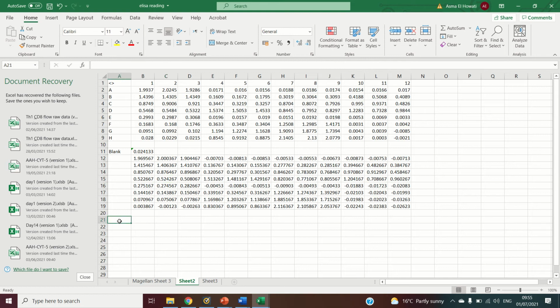So I will start with setting up the standard values, the concentrations that I know. In this instance, I've used IL2. So this is plate reading of the amount of IL2 in my media. And the standard concentrations started with 1000 picogram, and then continued with serial dilution.